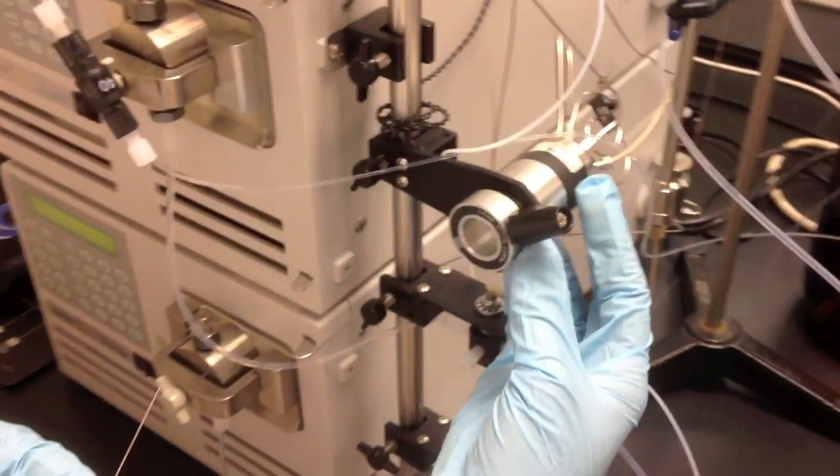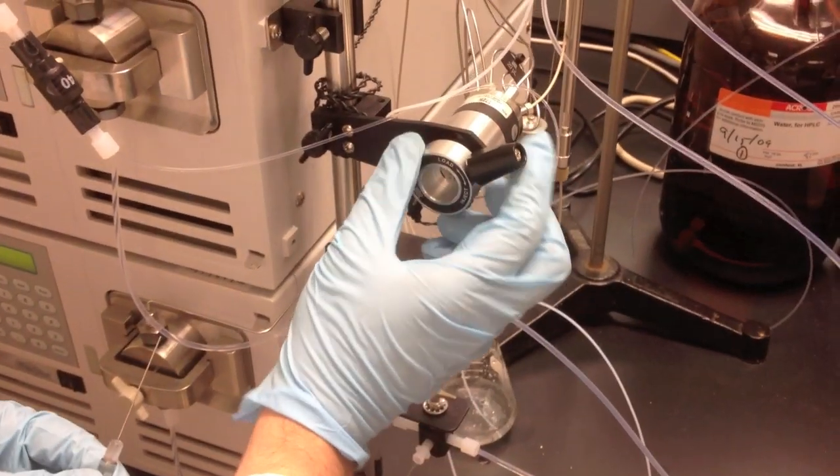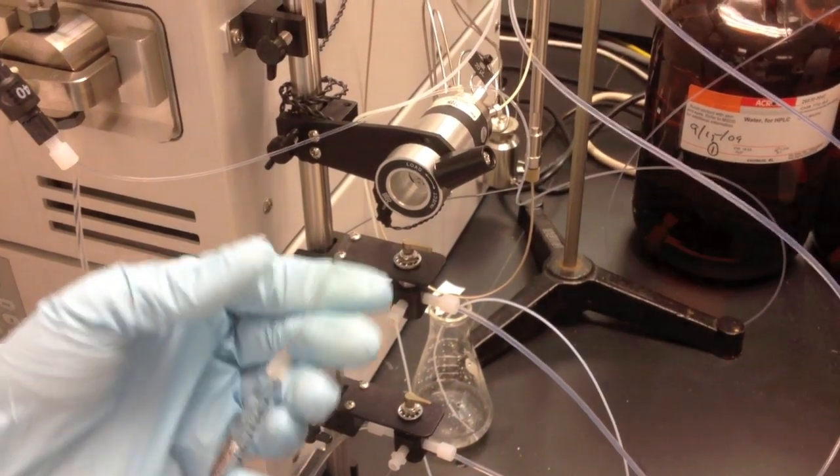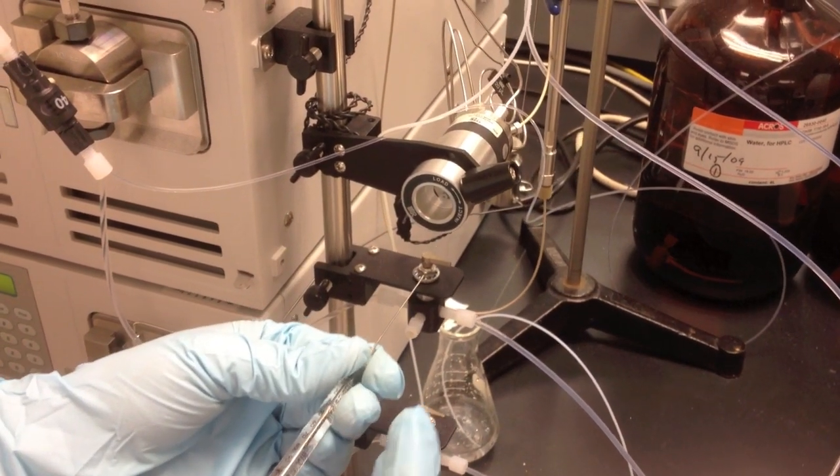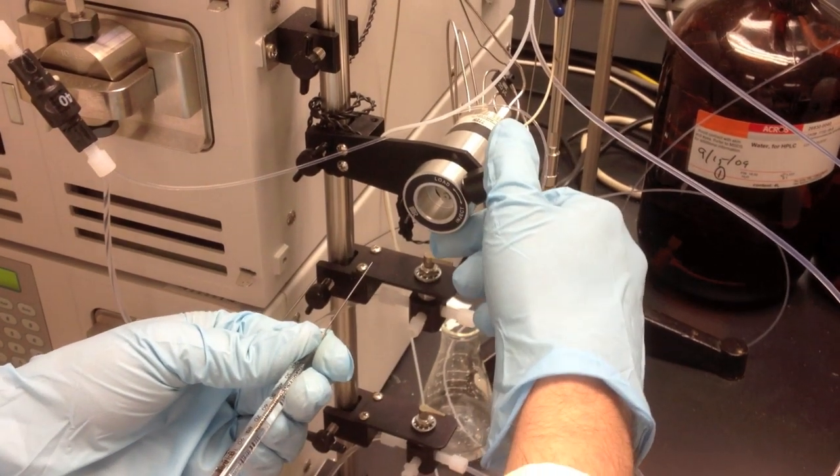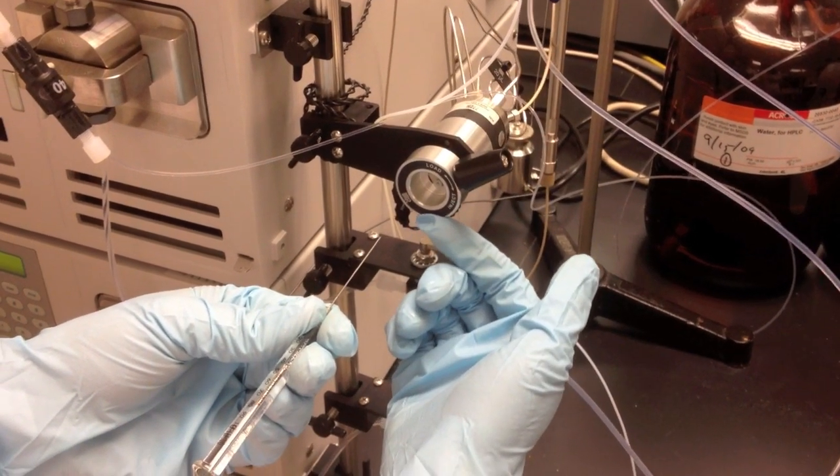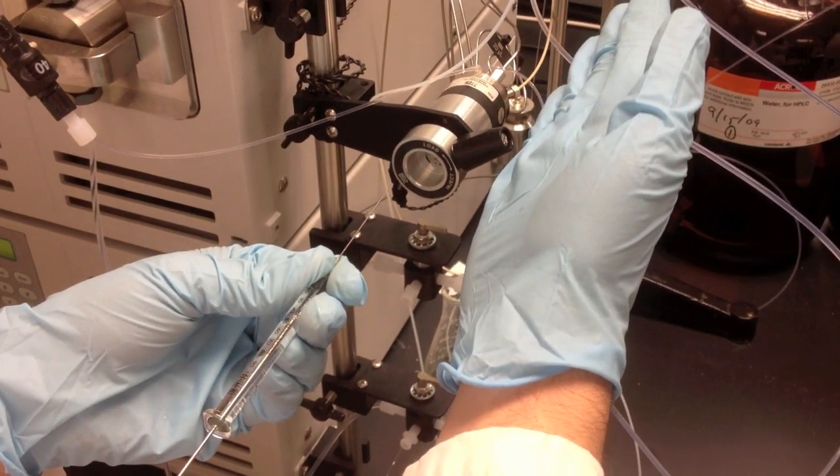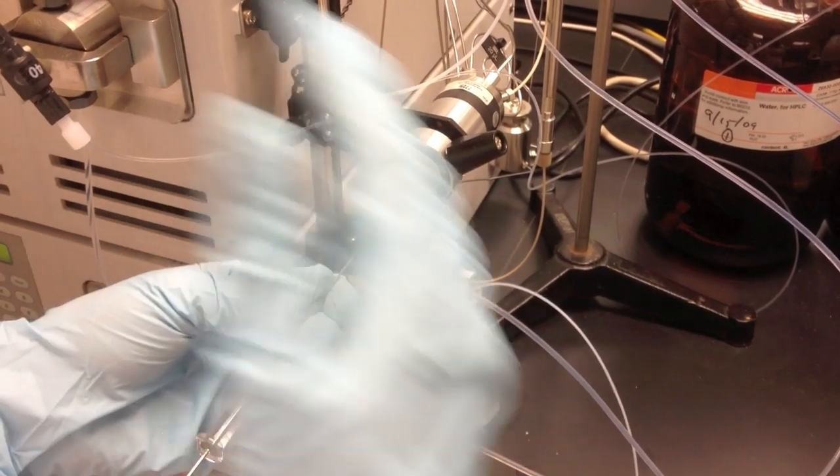This is the injection port. Make sure this knob is in the up position. So we're going to insert, shoot our sample on, and we're going to drop down this knob and count to five. Once that's done, we're going to push the knob back up. And that's all the injection. The rest is automated.